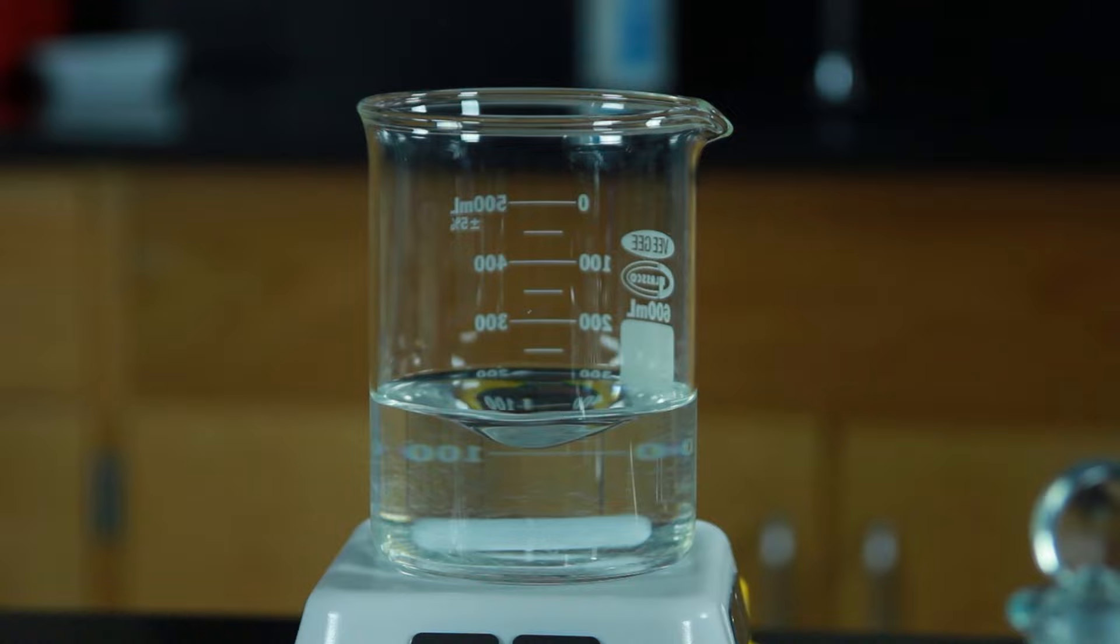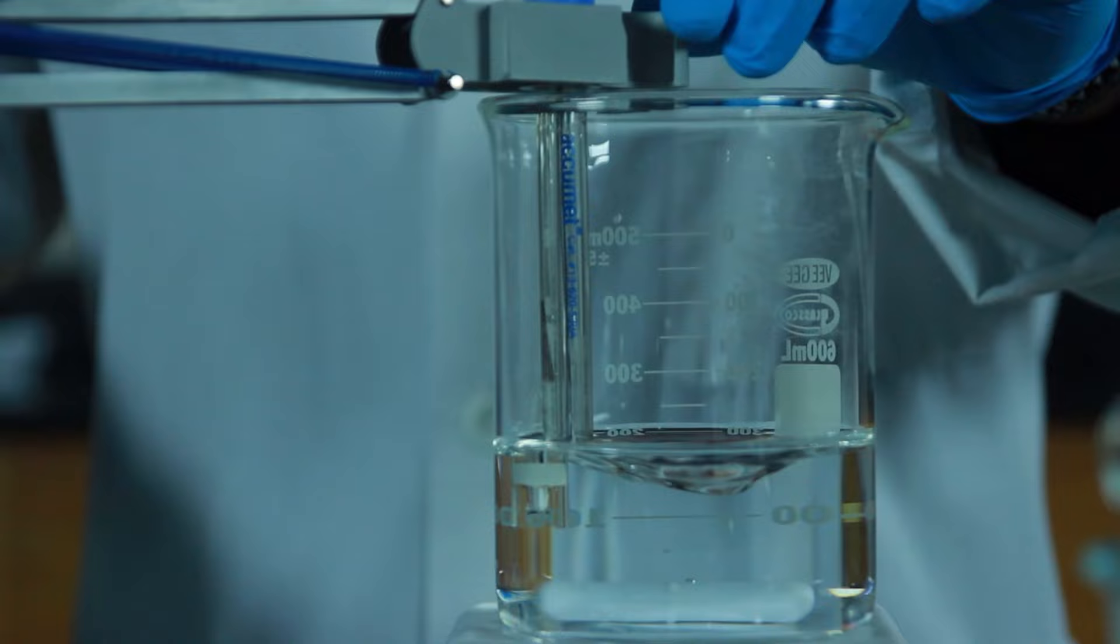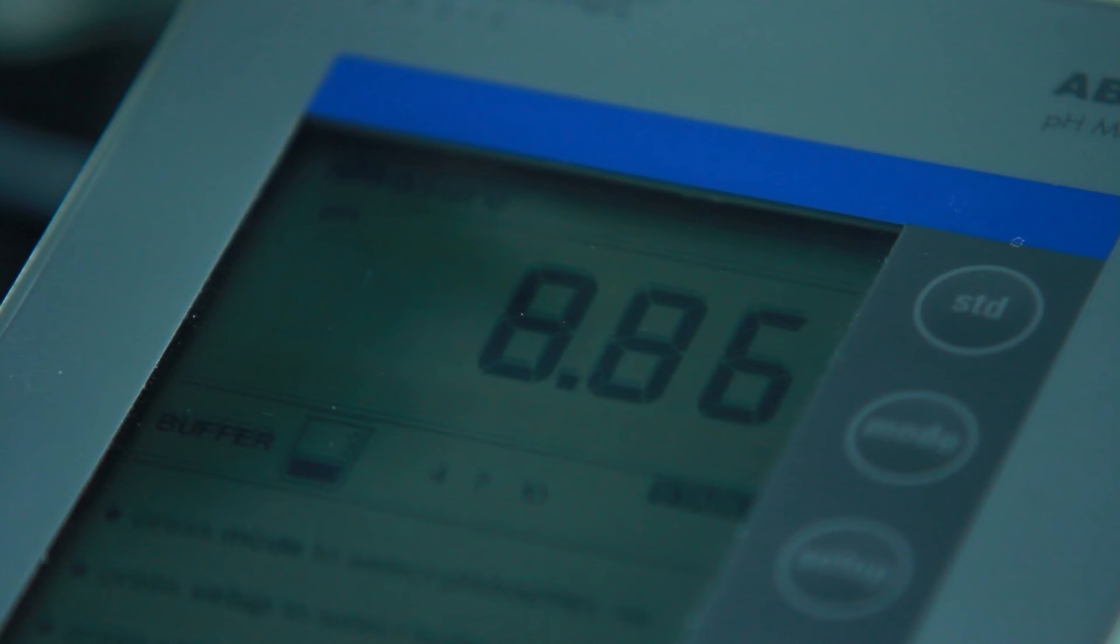Now we need to adjust the pH of our Tris buffer to reach our target pH of 7.8. Insert the pH meter probe into the solution. Be sure that you don't put the probe in too deeply because you don't want the stir bar to come into contact and damage the glass electrode. Watch the display and wait for the pH reading to stabilize. The current pH of the Tris is 8.86.